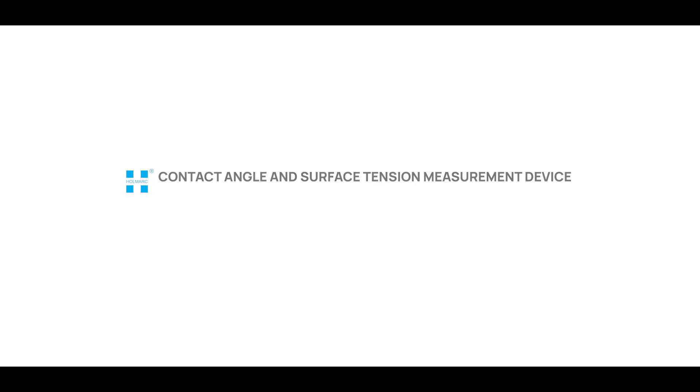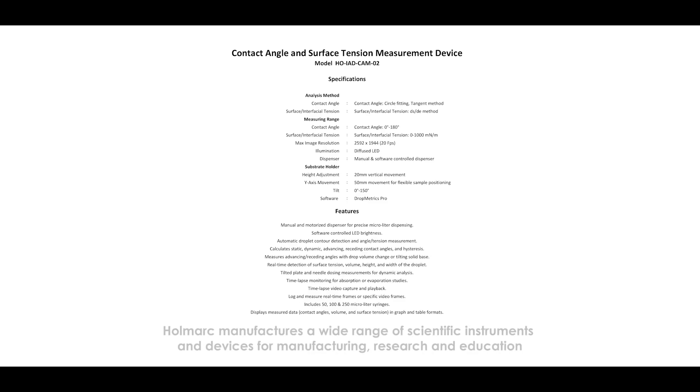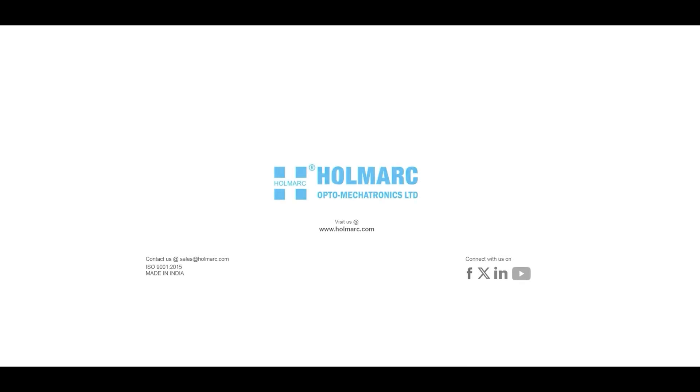Holmark's Contact Angle and Surface Tension Measurement Device, Model HO-PHIAD-CAM02. Holmark manufactures a wide range of scientific instruments and devices for manufacturing, research, and education. Visit us at www.holmark.com and contact us at sales at holmark.com. Order your products now.